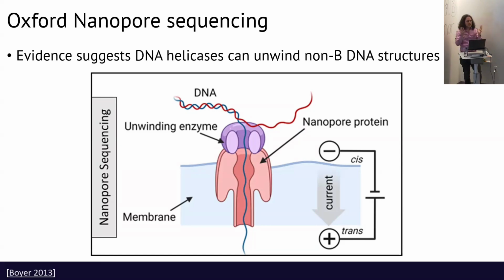So this is the direct evidence of structure that I think we can actually make a feature out of. And so what's the feature? The feature is, how long does it take to ratchet the DNA through the pore?